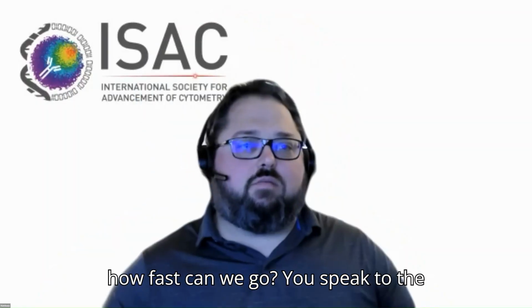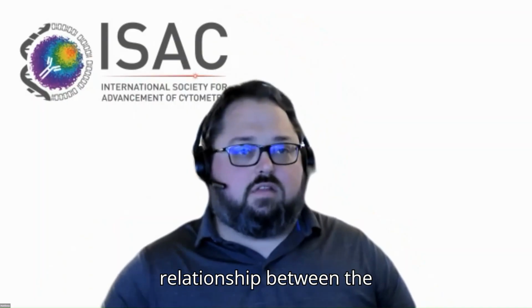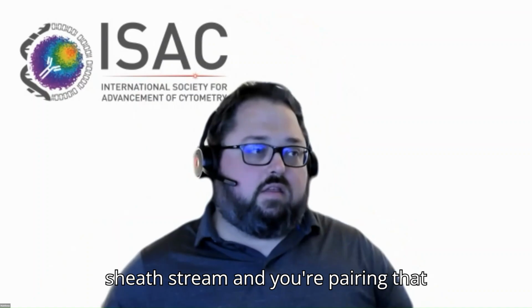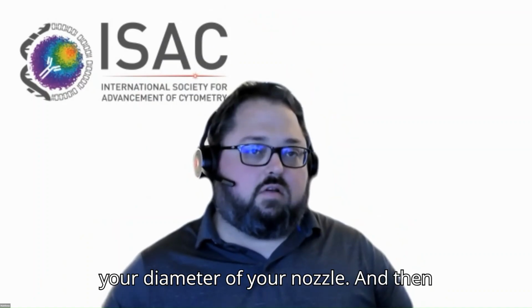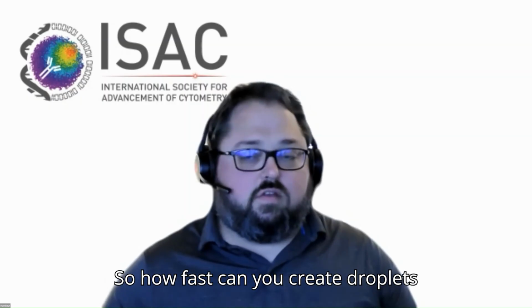So how fast can we go? You speak to the current limits of speed. That's a great question. I think it's really going to be limited by a relationship between the amount of pressure you can put on the sheath stream, and you're pairing that with nozzle size, which is going to be the diameter of your nozzle, and then you're going to pair that again with the droplet frequency. So how fast can you create droplets stably?